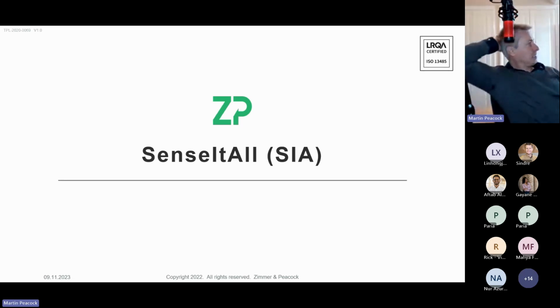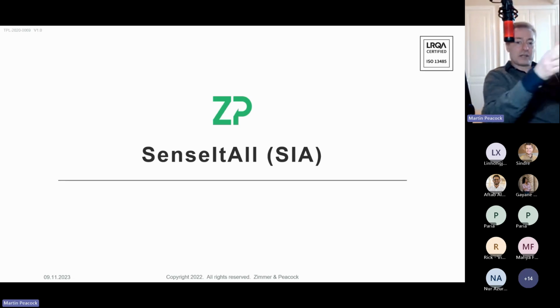It's also the process that you saw. Sindre and Lynn in particular said, we added the concentration of glucose every time at the same time. So there's a process in place which got implemented in the lab. They uploaded the data. Then Lynn can write a template which will just analyze the data, and it's the same for Sindre as well. You need a process in place, everyone buys into the process, they upload the data, and then we can just run our template.